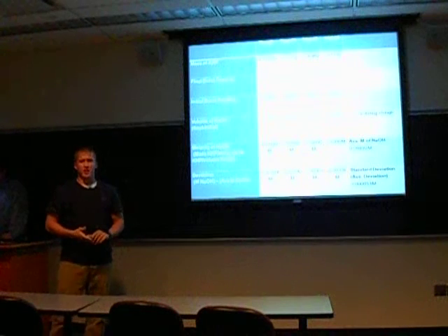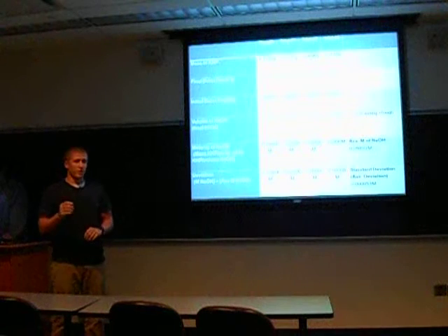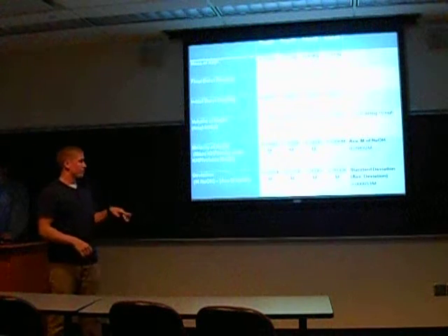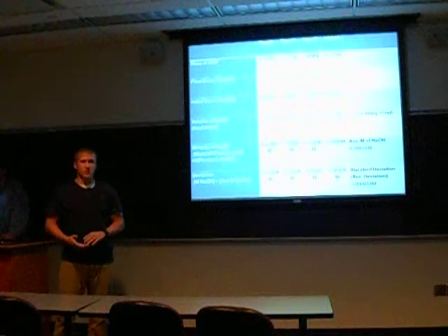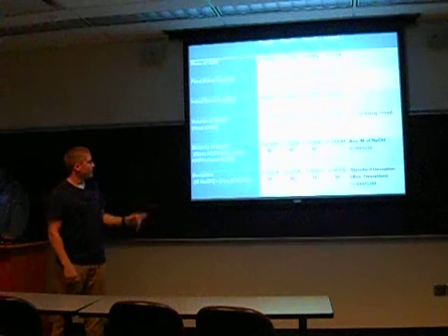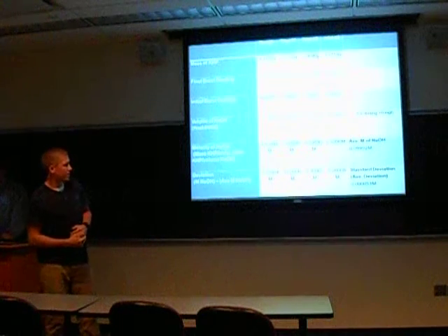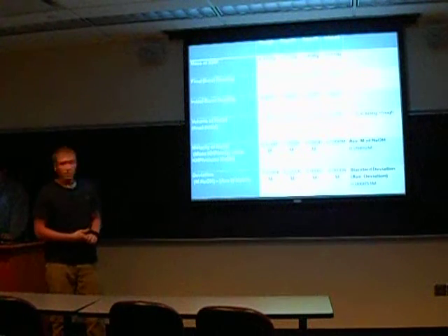And we started at 0 every time, once again for convenience, so that we could easily convert whatever the burette read, that was actually the total volume that we used. And then we could use that volume in the calculations to determine the molarity as well as the deviation. And we'll show that in the next slide. But as you can see, the numbers for the rough were actually pretty rough. So I actually excluded that from the molarity and the deviation for accuracy.